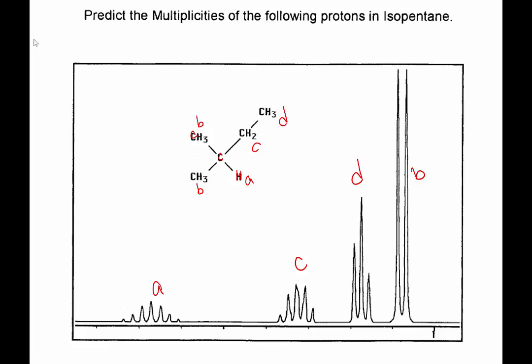When you get into these complicated structures, that means you're a group in between two non-equivalent groups. Sometimes they'll be perfectly symmetric. Other times they'll be kind of unsymmetric, which might mean that you have two groups really close in chemical shift that are overlapping. And you'll see some examples of that, particularly in the homework.